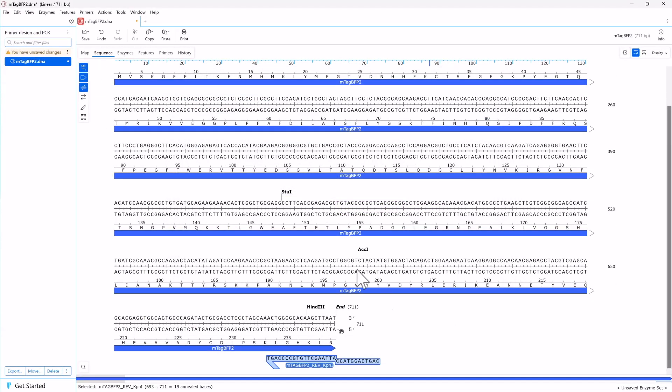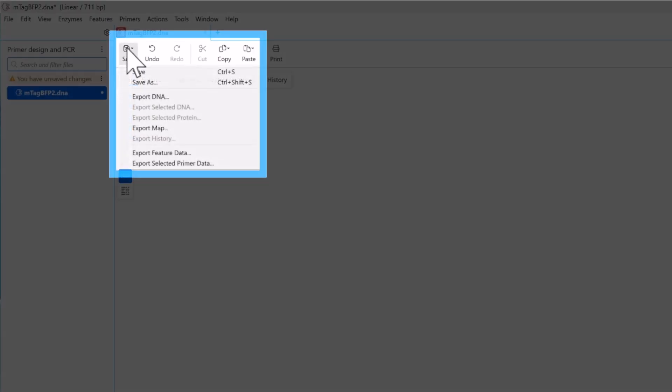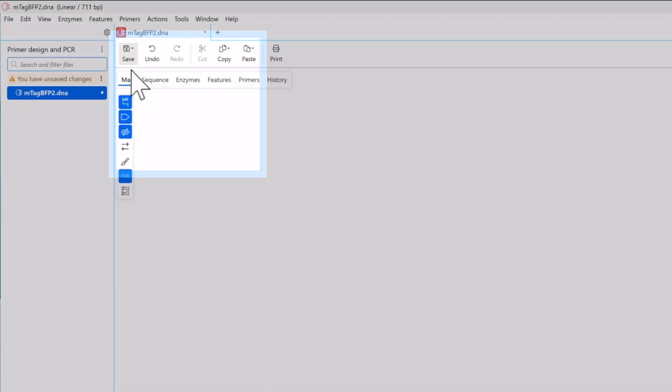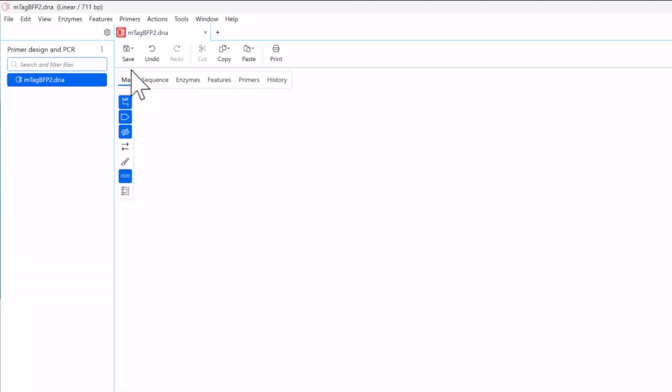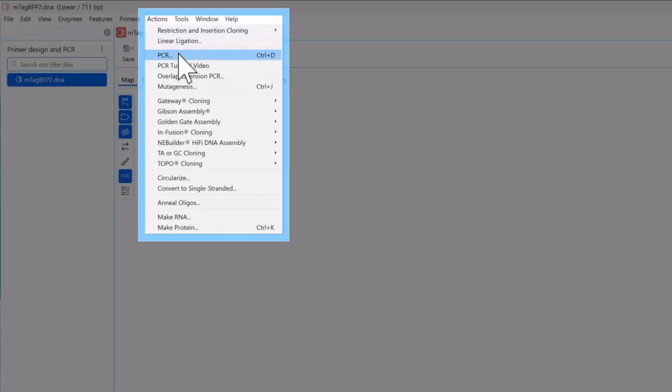Finally, click Save to save the two new primers on the sequence. Now that your PCR primers pair are designed, you can simulate the PCR by choosing Actions and PCR.